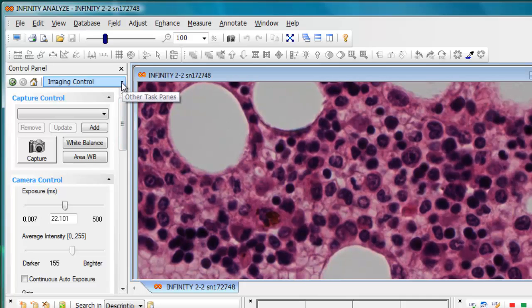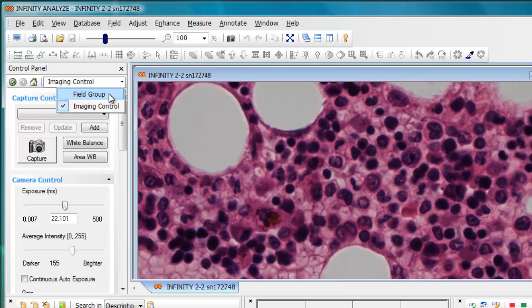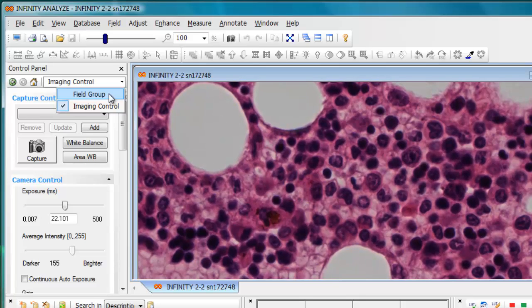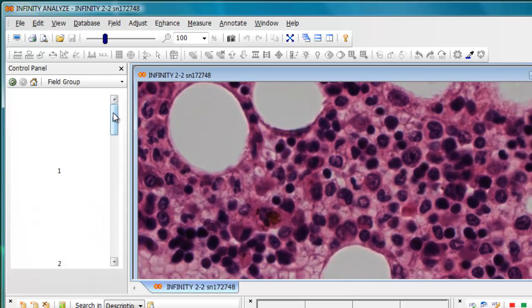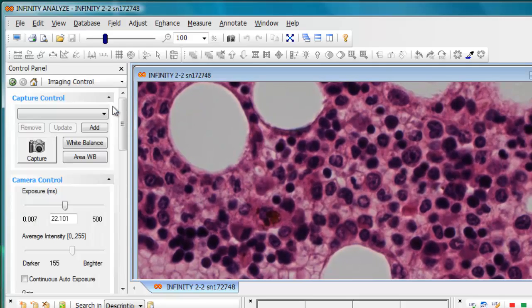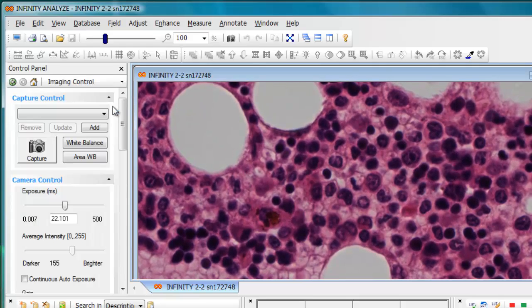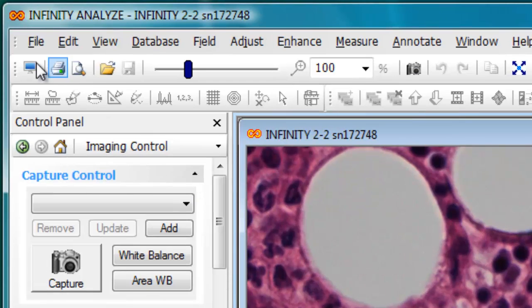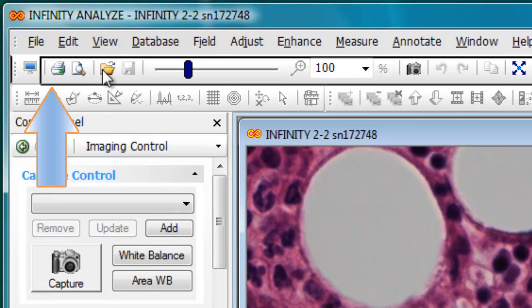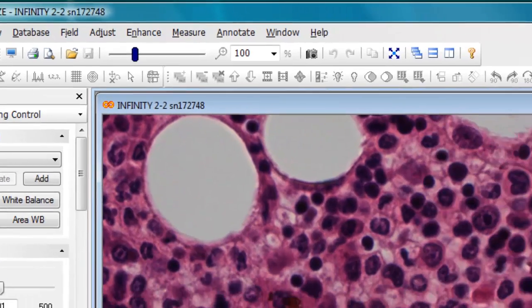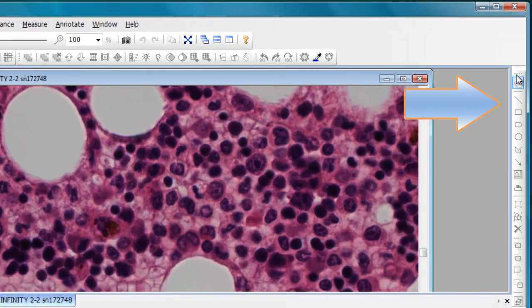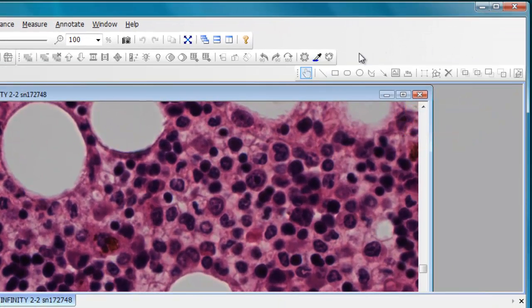This imaging control function allows you to select between displaying the panel on the left hand side or displaying images that would be stored in the field group. The positions of the toolbars can be moved simply by dragging them, and even toolbars which are displayed on the side can be moved elsewhere in the dialog.